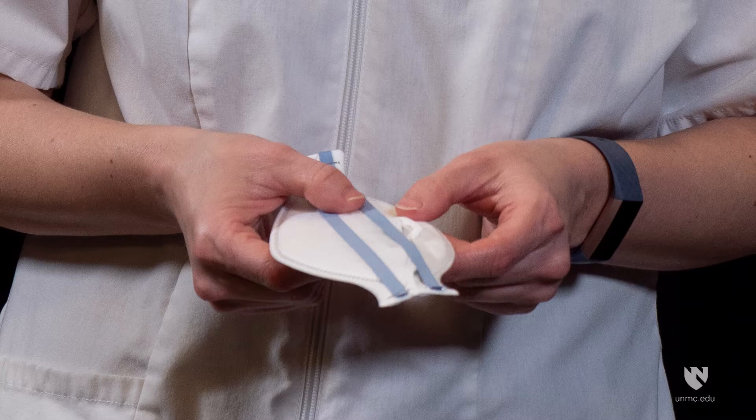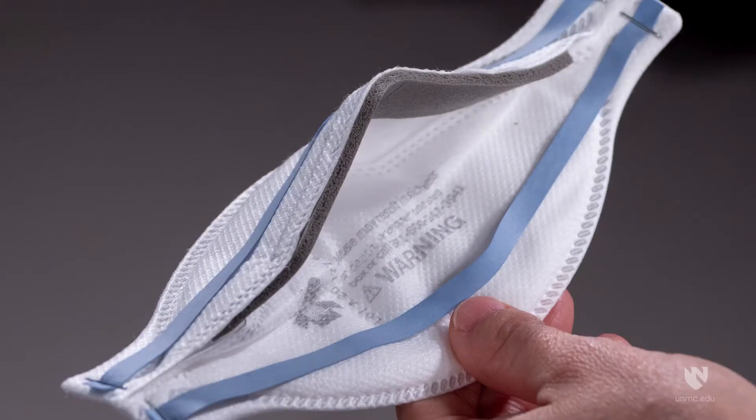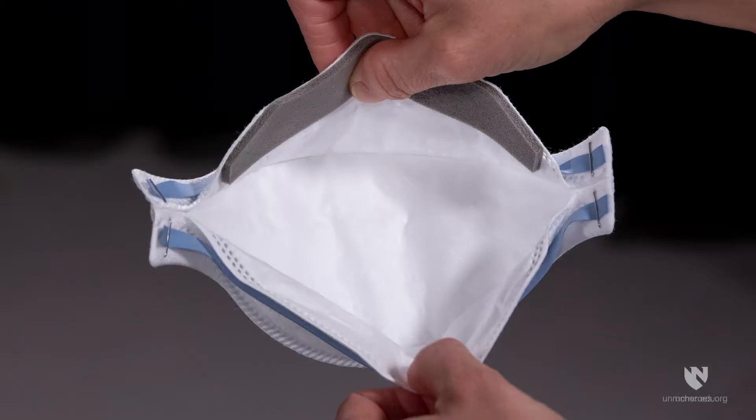Remove respirator from packaging and hold with straps facing upward. Place bottom strap along bottom panel next to the warning statement. Fully open the top and bottom panels, bending the nose piece around your thumb at the centre of the foam. The straps should separate when panels are opened. Ensure bottom panel is unfolded and completely opened.